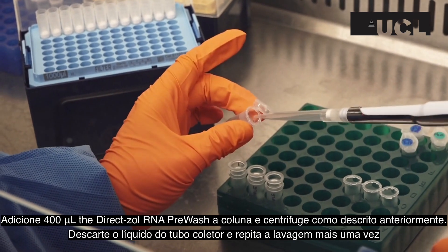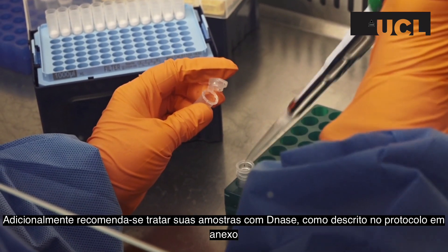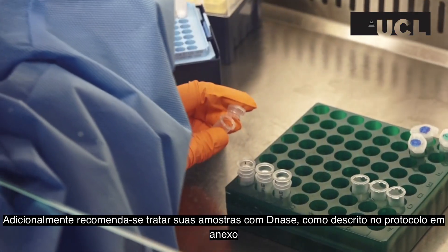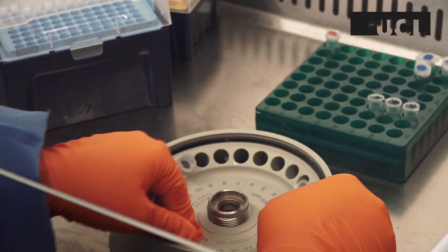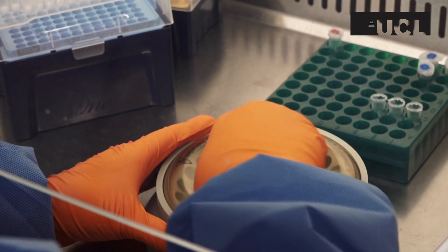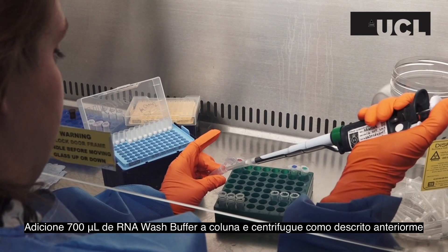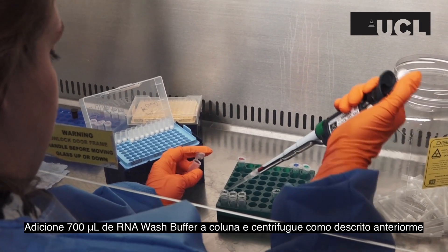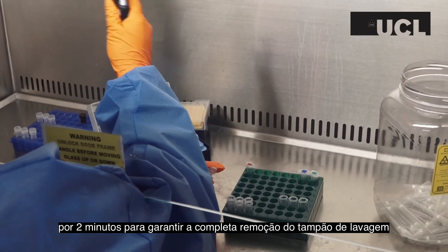Discard the flow through and repeat this step one more time. A recommended extra step is to DNase treat your samples as described in the accompanying PDF protocol. Add 700 µl of RNA wash buffer to the column and centrifuge as described before, for 2 minutes rather than 30 seconds, to ensure complete removal of all the wash buffer.